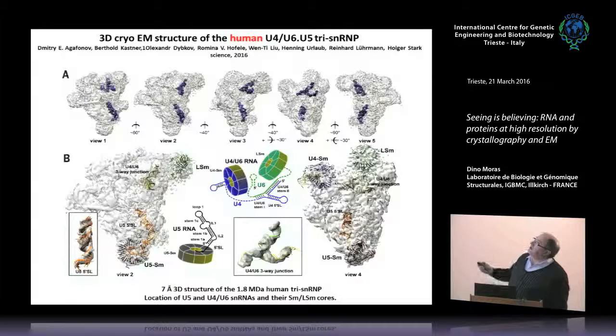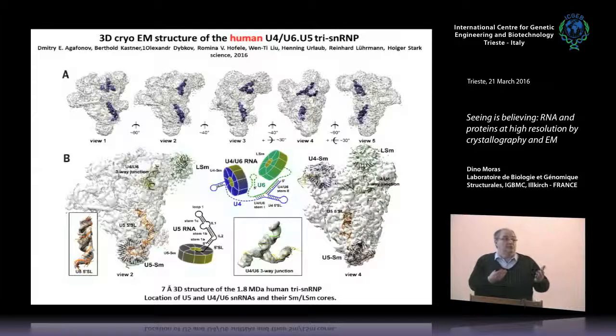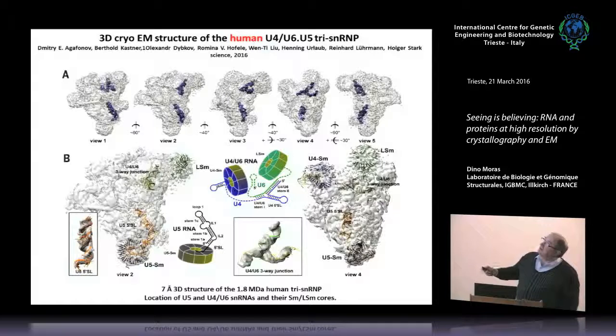And for example, they have 2 references, the crystallography and the yeast structure, at least not the latest result of the yeast, but the one at least of the last year, which was the architecture. And you can see that highlighted in the paper. For example, here is the real experimental density for the 3-way junction, the U4, U6. That's an RNA, as you see it. And that's the model realized density.